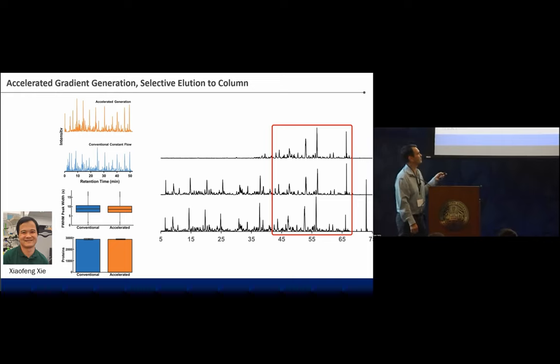All right. And then this is our interface here, great for a PI, because from here I can just log in and say, okay, what are we running right now? Click on one of these or search based on the person running the experiment or anything like that. Since these are automatically searched, I can just pull it up and see how the runs are looking. If we were to click on one of these, we can look at the chromatogram, we can look at the injection time, anything we want here.